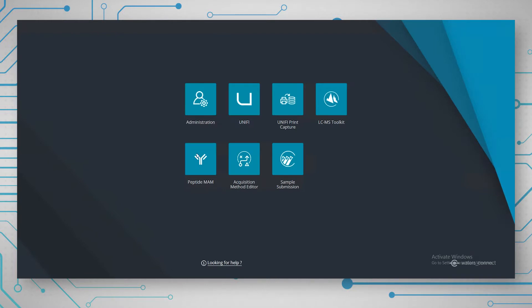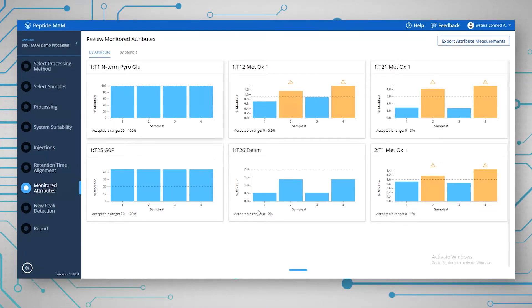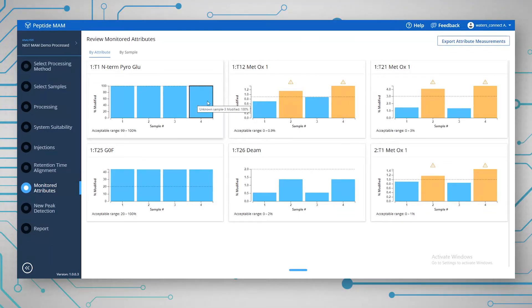Before I show you the workflow from start to finish, I'm going to quickly show you what the results look like for a Peptide MAM experiment. This is basically the overview of the monitored attributes. This experiment is monitoring six attributes in a NIST tryptich digest — it's a small sample set used to demonstrate the key features of the Peptide MAM workflow. There are four samples of NIST digest: samples two and four have been stressed, and samples one and three are control samples.